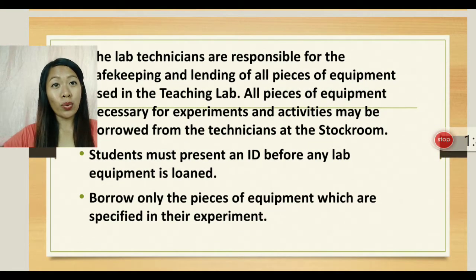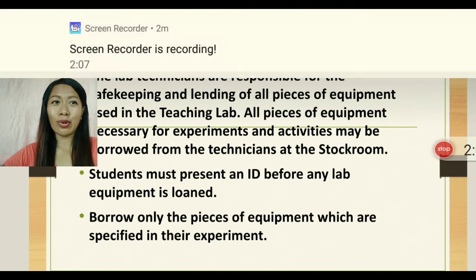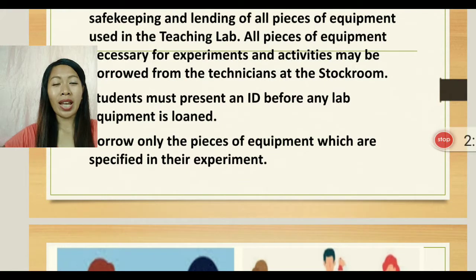Now, in the issuance of laboratory items, we need the laboratory technician. The laboratory technicians are responsible for safekeeping and lending of all equipment that are used in the teaching lab, and all pieces of equipment necessary for experiments and activities may be borrowed from the technician at the lab or at the stockroom.